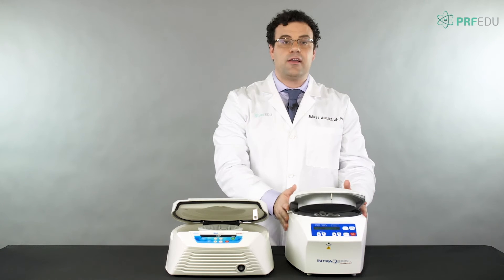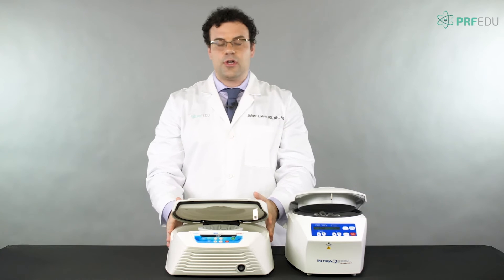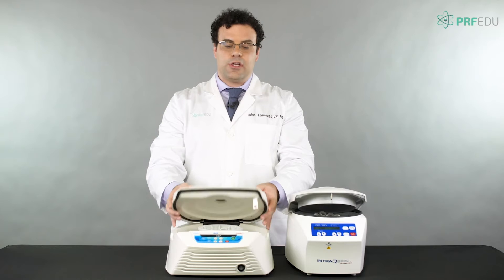Generally speaking, fixed angle centrifuges are narrower but taller because of the 45-degree angle, while horizontal ones are wider and a little bit shallower.